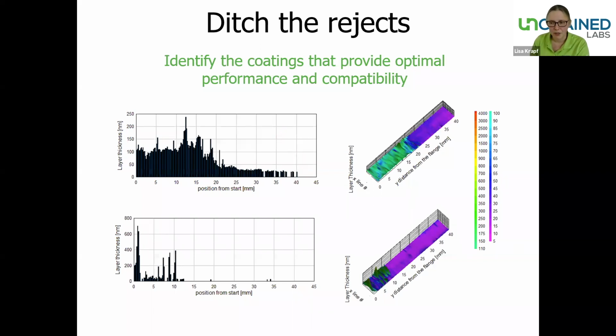So you can find the ones with a good siliconization, and more importantly, the ones where siliconization doesn't fulfill your requirements. So on this slide, we have 2 examples. The syringe investigated here on the top, we see that along the length of the syringe, we have silicone everywhere. And you could conclude that for this one, the risk is pretty low that you would need a huge force to move the plunger through this syringe.